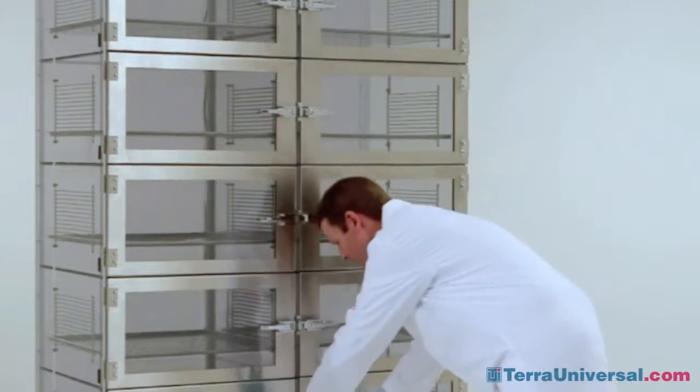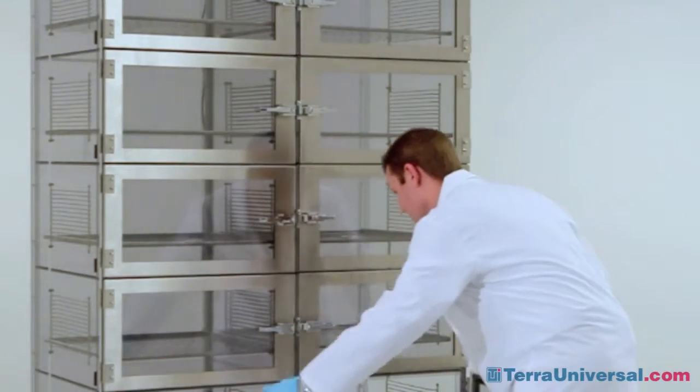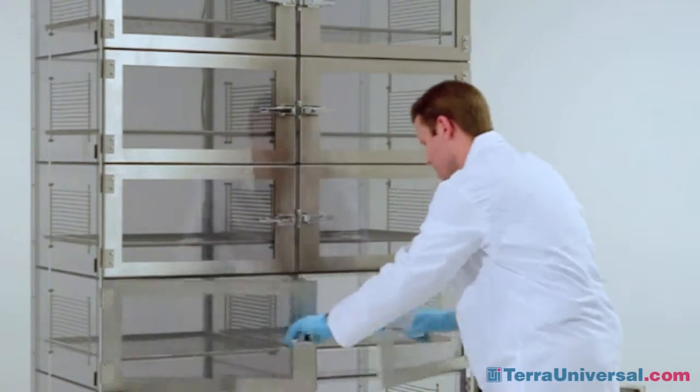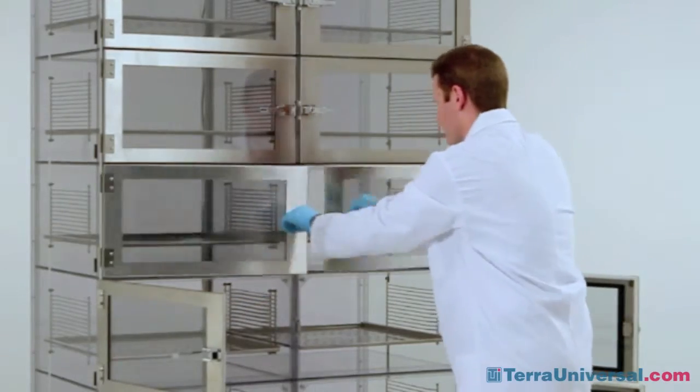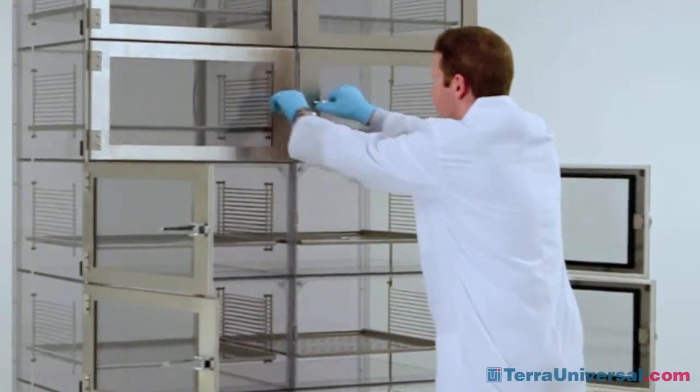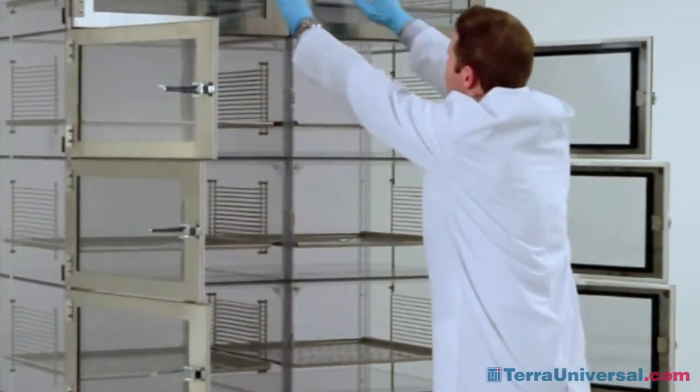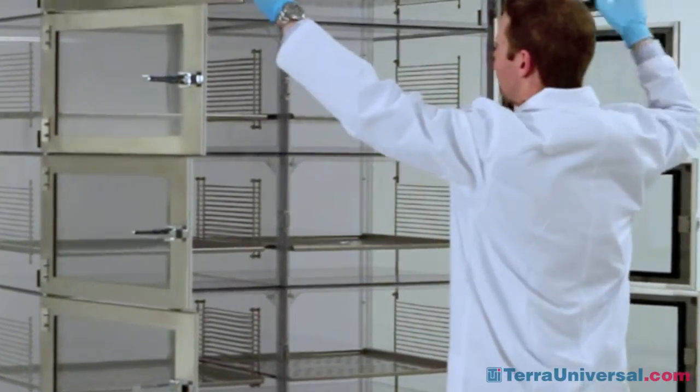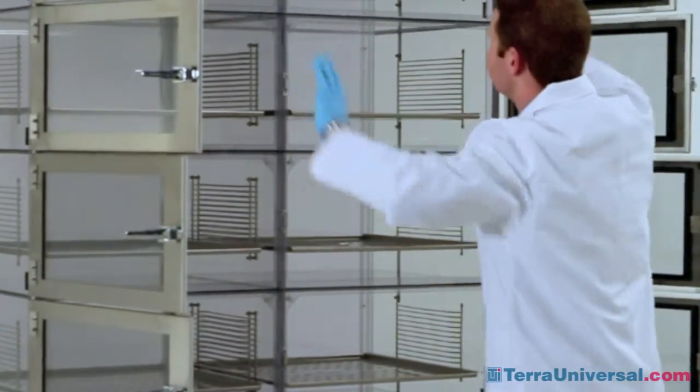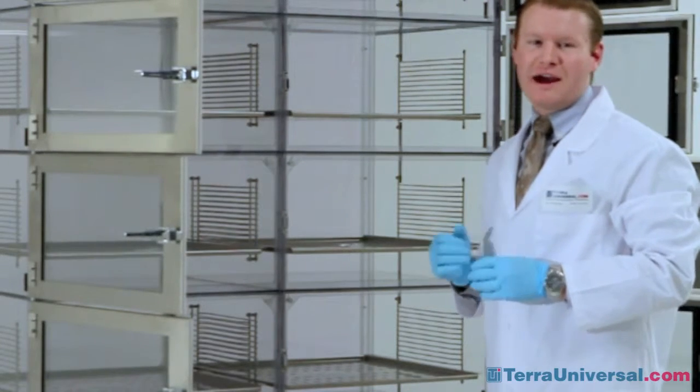First thing I will do is open each of the doors, beginning at the bottom. At this point you don't want to have your dual purge running or any type of nitrogen running into the chamber.